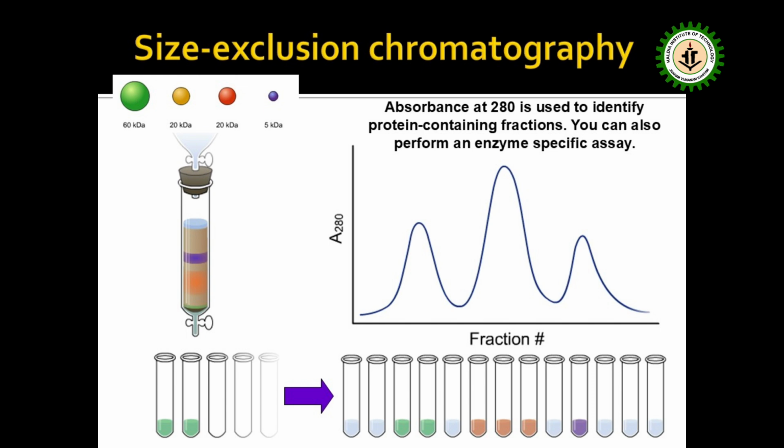And this is the separation technology of the gel filtration chromatography media, and you see how gel filtration separates a mixture of different molecular weights: 60 kilodalton, 20 kilodalton and another 5 kilodalton.